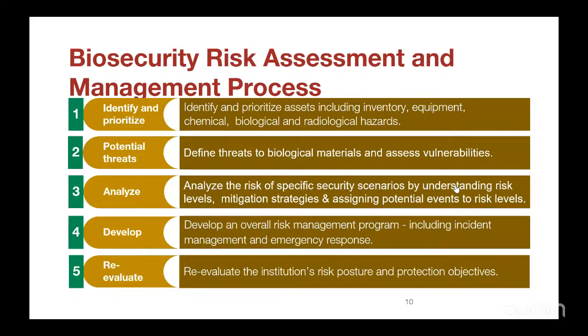Now, risk assessment is a very good aspect of safety and biosecurity. Whether it is biosafety or biosecurity, we're trying to look at what things we need to put in place. First, we identify the potential of harm. Then we analyze it, and at the end of the day, we put in strategies to mitigate it. That is what risk assessment is all about. But we are not discussing risk assessment yet. Discussing risk assessment is another whole thing. This is an overview of how you could implement risk assessment in biosafety and biosecurity.